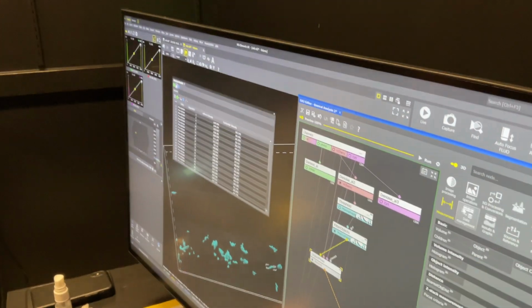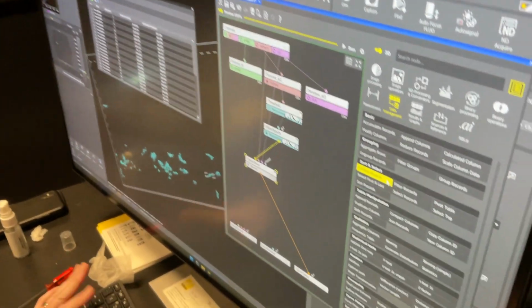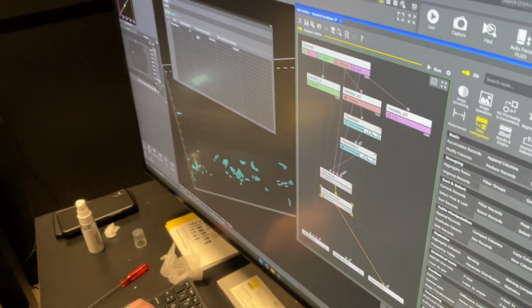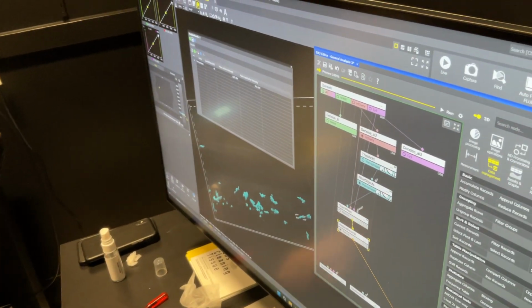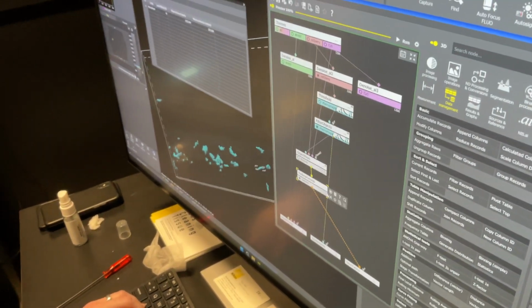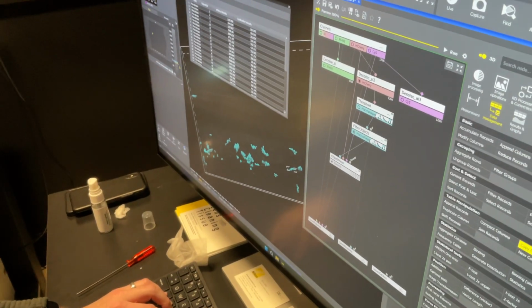There's your layer. Data management, we can do all sorts of other things with it. This gets a little crazy, but I could say, oh, let's reduce those records. And now I can get, out of all of those, the mean intensity. Just another thing you can do with it. And you can reduce those records by a variety of different things, by grouping and sorting. Where is it? Calculated column.